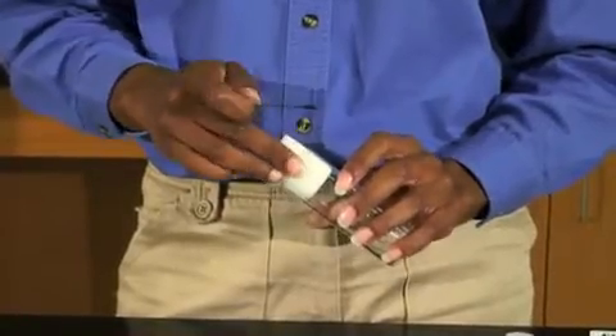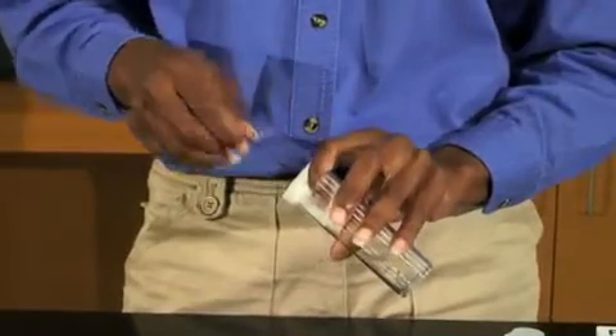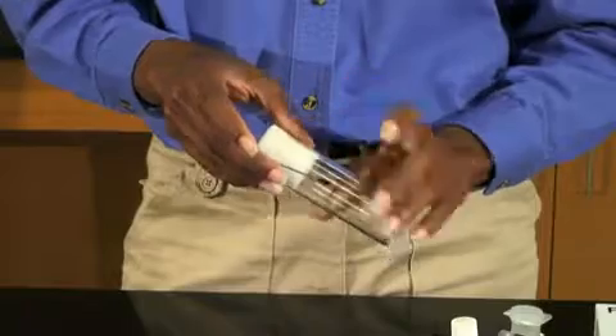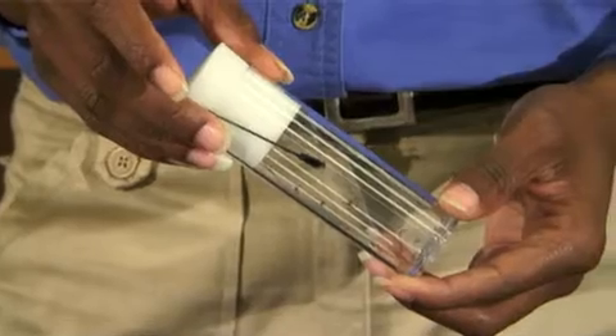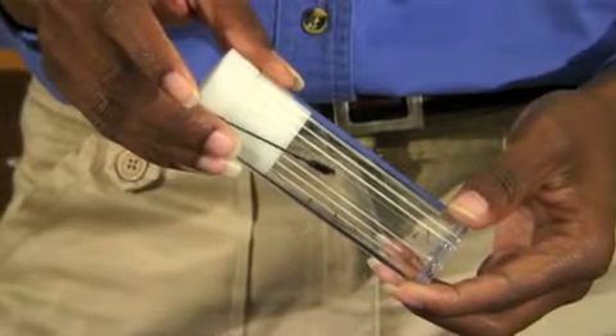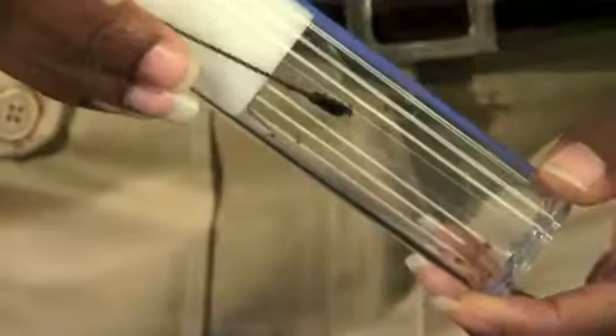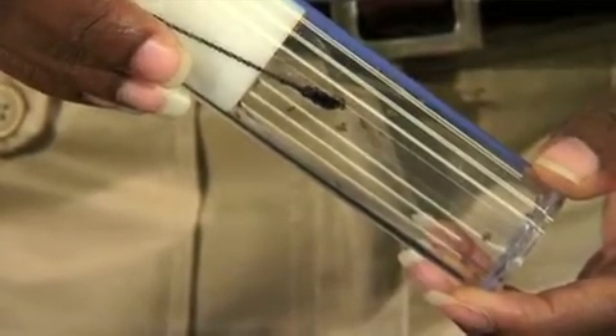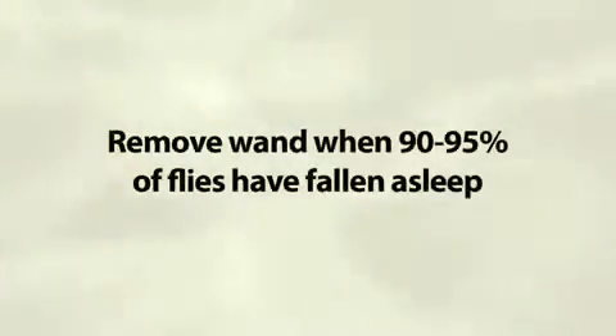Use one finger to push the plug in the anesthetizing vial slightly to one side. Quickly stick the anesthetic end of the wand into the vial, and position it beside the plug so that the anesthetic tip is below the plug. Keep the culture vial upright with the wand in place. Watch the flies closely, and remove the wand when 90 to 95 percent of the flies have fallen asleep.